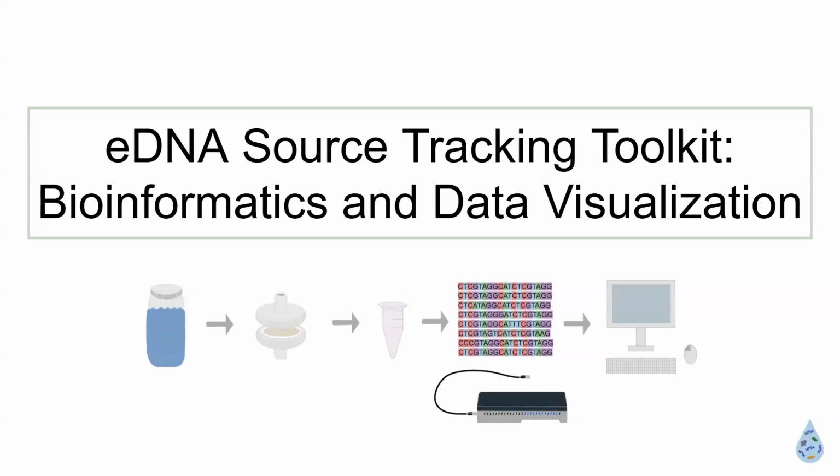-20, make sure that you're using a lab grade freezer, not just a Home Depot freezer that goes through freeze-thaw cycles or a frost-free freezer. -80 of course doesn't do that, so it keeps it at cryogenic temperature. So it's definitely more ideal if you have that accessibility.